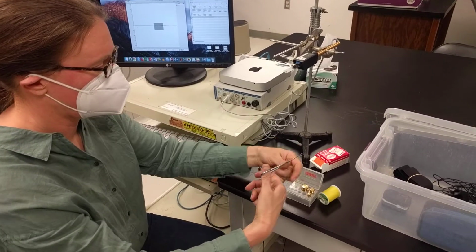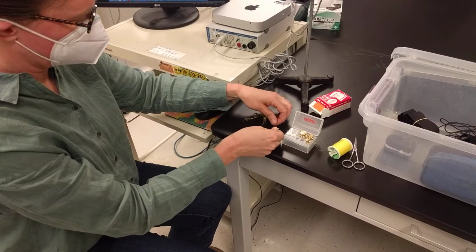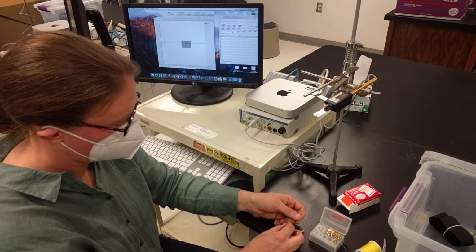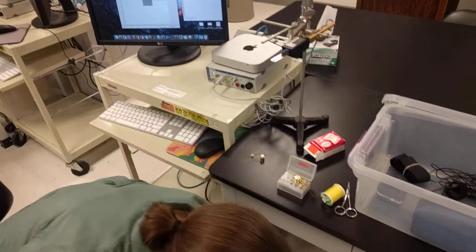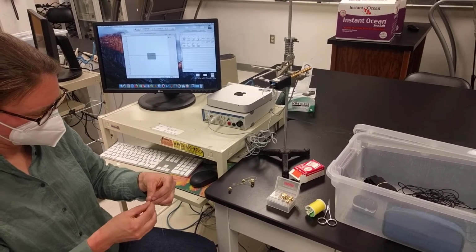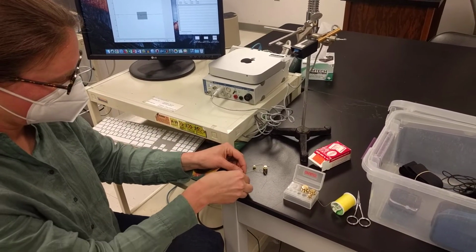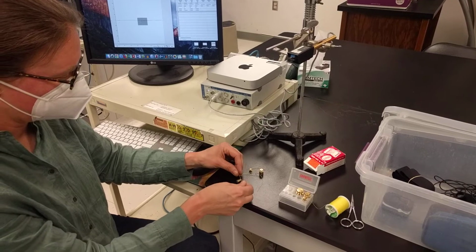Oop. Maybe I can cut thread, maybe I can't. Maybe I can tie a knot, maybe I can't. Oh, let's do another type. Oh, can't tie any knots. Cut the camera. No. Let's do this. Okay, so there's a loop. We'll just square knot this. There won't be any knot tying questions.